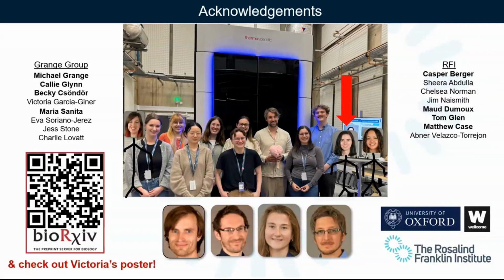Hi, thank you for the presentation. I'm wondering, on your vertical lift-out, the first lift-out, how do you protect the leading edge of the block? How do you deposit the protective layer? You mean for making the lamella afterwards?